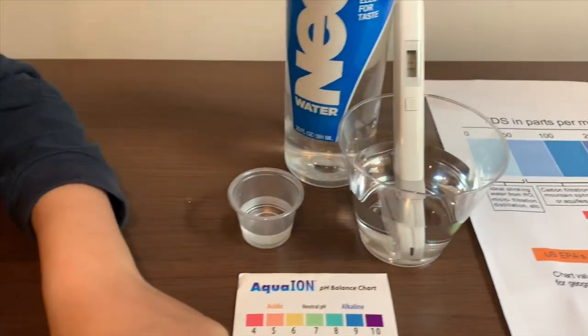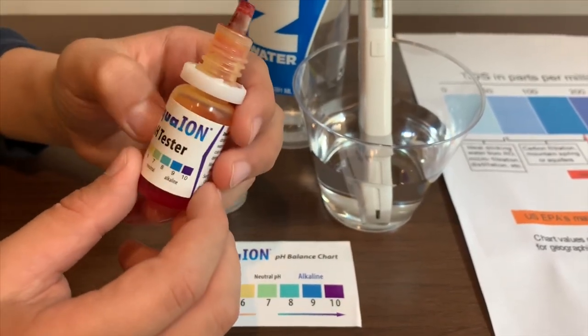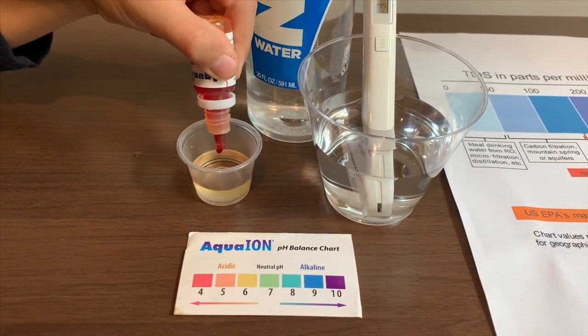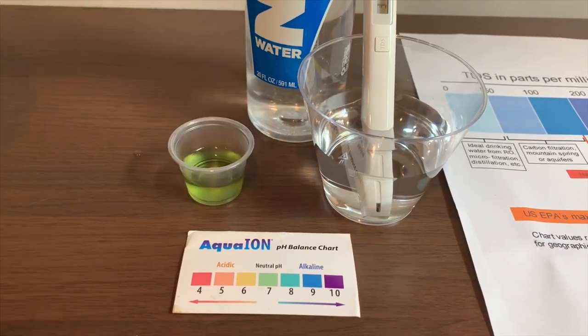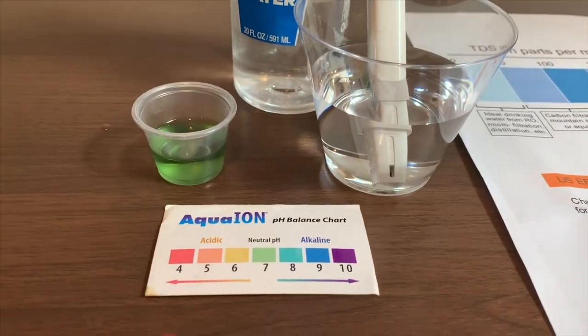Now let's test the pH level. If you want to buy this Aqua Young pH tester, the link is down below. Only do two drops. It reads 7.